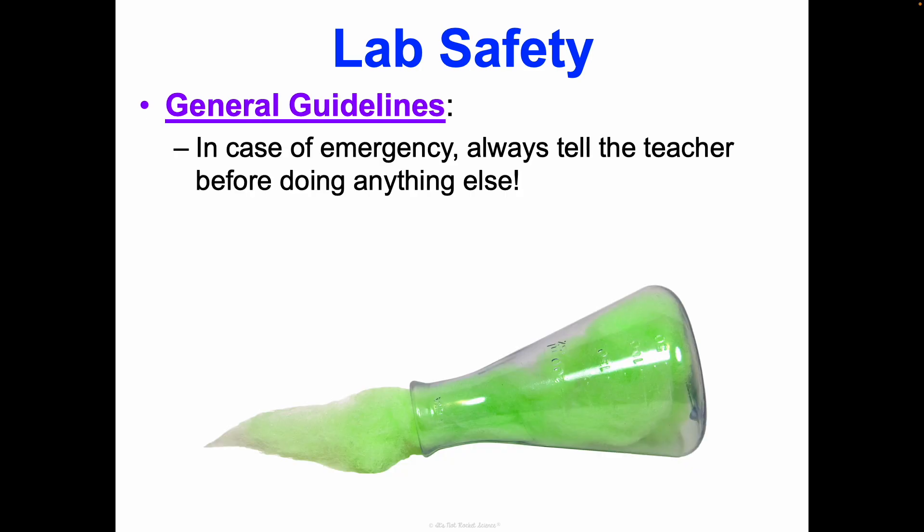In case of an emergency — like you do spill something or crack something — always tell the teacher before you do anything else. No matter how minor you might think it is, I want to know. Your teacher wants to know because you may think something's not a big deal, but different chemicals have to be disposed of in certain ways. Broken glass cannot just go in the trash can because it'll tear the bag; we have a broken glass disposal. If something gets on your hands, I need to make sure you wash them appropriately. So if any accident happens, always tell the teacher.